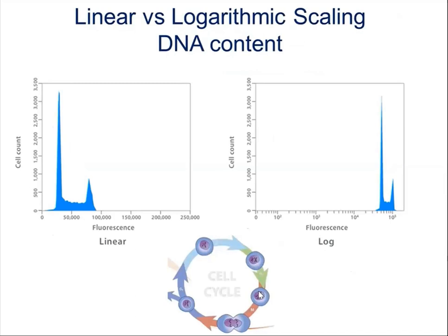When it goes to S phase and then comes to G2M phase, the chromosome number doubles, so it becomes 4n. Okay, so now the range is somewhere between 2n to 4n. You don't have 10n's or 1000n's or 10,000n's here. So the range is very, very narrow. It should be either 2n or it should be 4n.